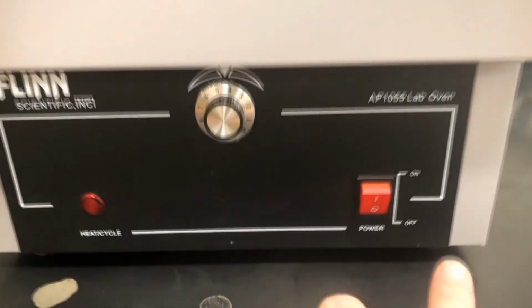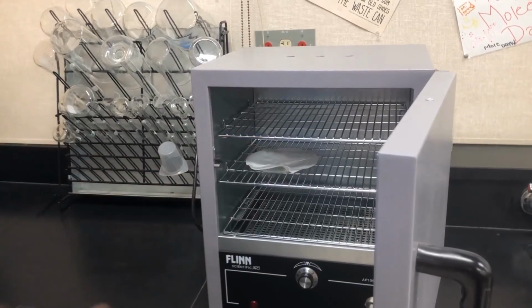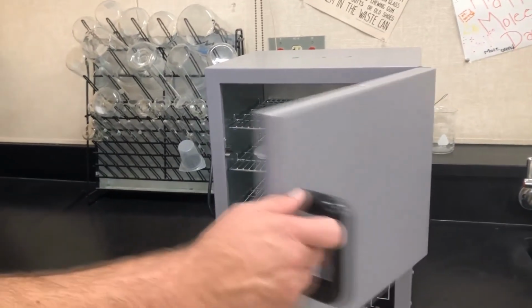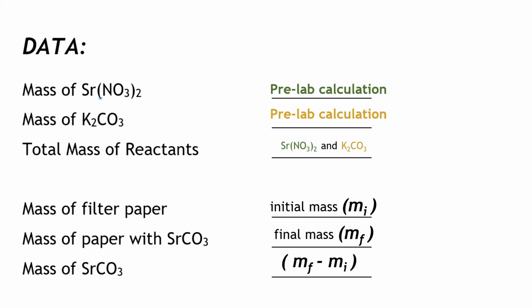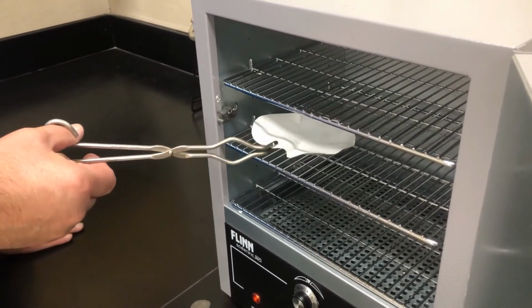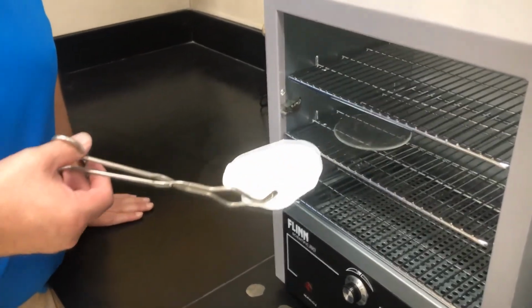We want to get rid of the water and leave behind the material, so we're going to use this drying oven. The filter paper that's still moist containing the precipitate will be placed in the drying oven for a period of time. Now when we get done with this, we will have another mass. We already know what the starting mass of the filter paper is, the initial mass, and the difference between the final mass and the initial mass will be the mass just of the precipitate strontium carbonate.